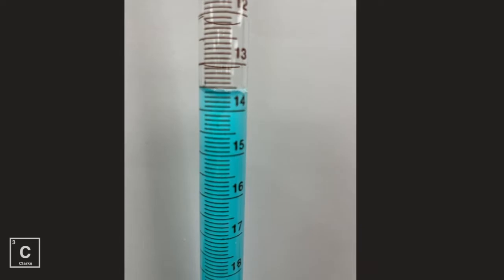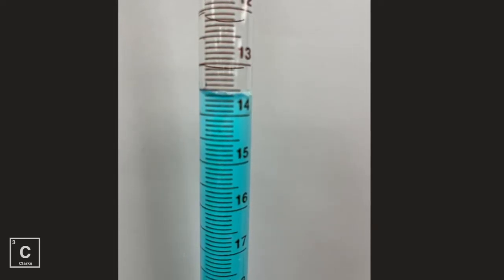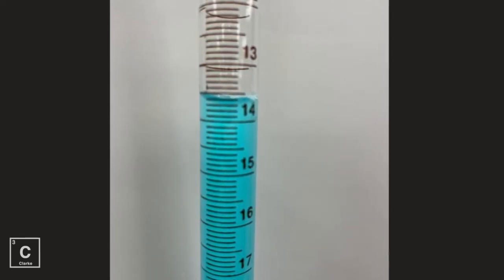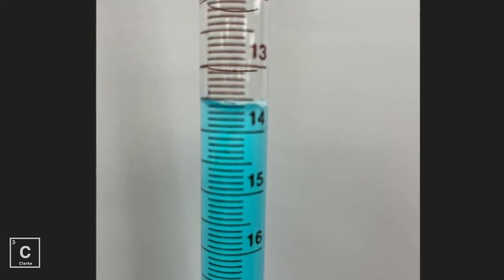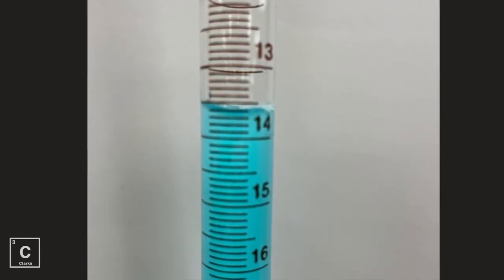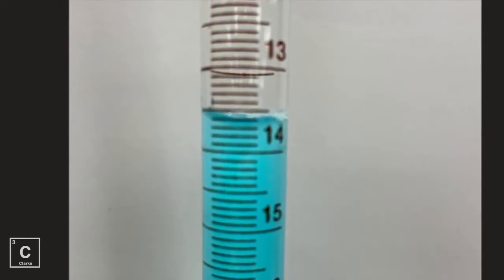This is how much stock solution I poured in. Now I want you to notice a few things. A burette numbers backwards because it's for dispensing. So you're going to need to take note of where the liquid level is now. In a second I'm going to dispense some. Then I'm going to show you the new level. You will need to subtract those to figure out the milliliters of stock solution that I dispensed.